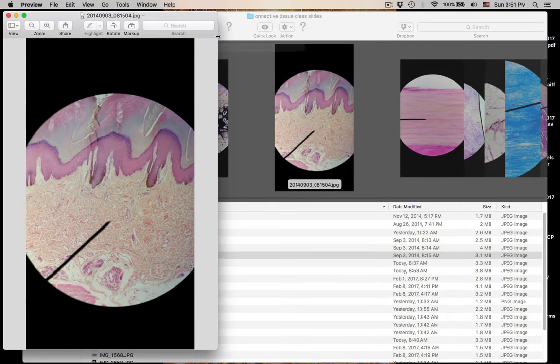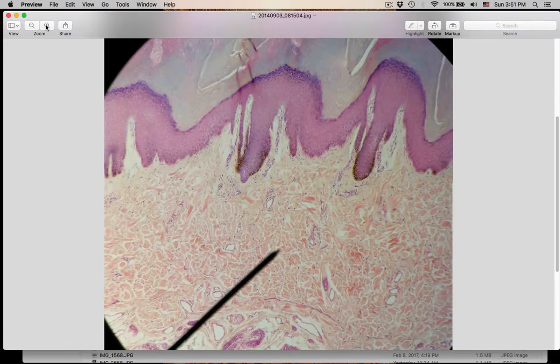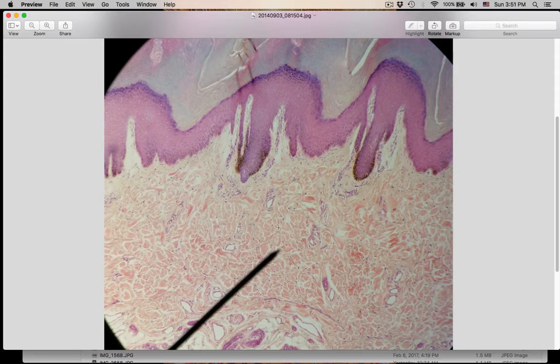Number six. The pointer is in this space. What is the name of this connective tissue? You know where you are by looking at this. What is this connective tissue right here?